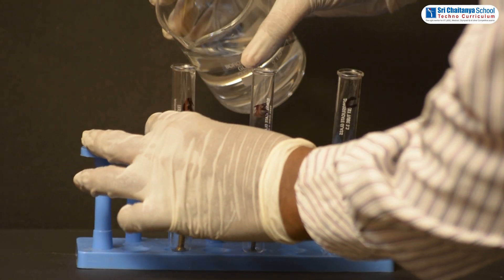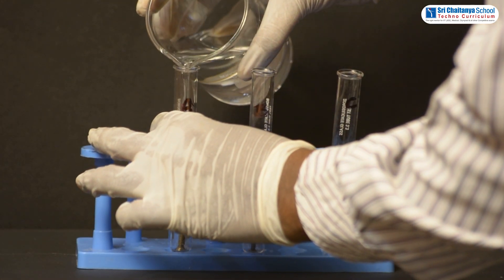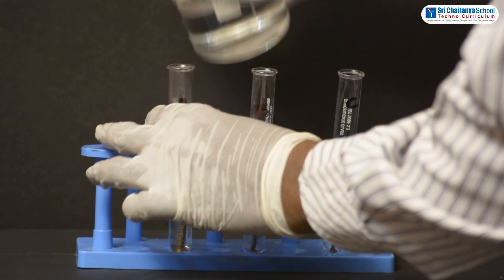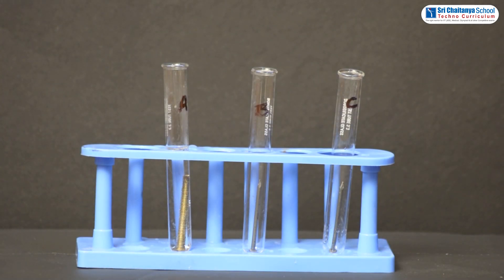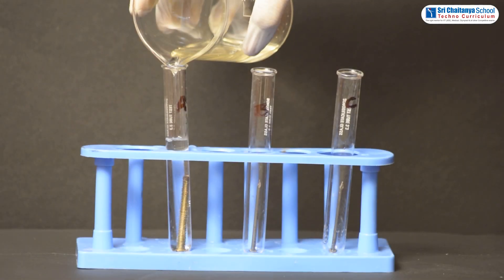Put boiled water in test tube A to remove any dissolved air. Add some oil and cork it.